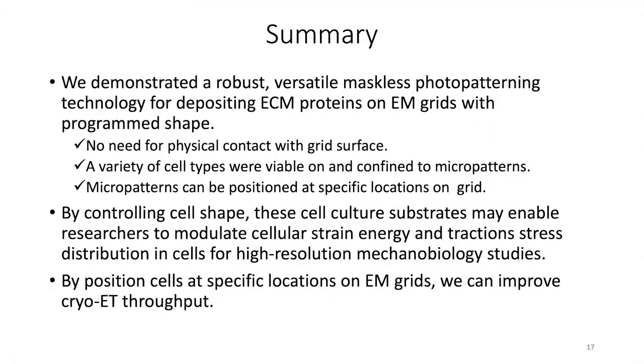To summarize, we have demonstrated a robust, versatile, maskless photopatterning technology for depositing ECM proteins on EM grids with programmed shape. This eliminates the need for physical contact with the EM grid surface for micropatterning, is compatible with a variety of cell types, and can be used to position cells at specific locations on the grid.